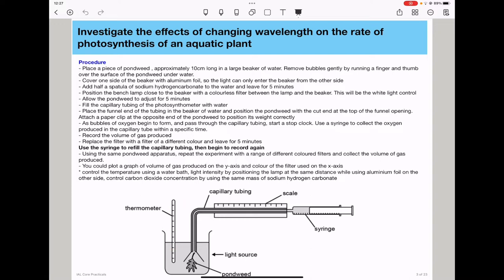We have a thermometer to monitor the temperature. We have a light source to provide light for photosynthesis. Photosynthesis is divided into the light-dependent and the light-independent. The light-dependent reactions require sunlight, so we'll need to provide that, so that reduced NADP as well as ATP can be produced in the light-dependent reactions, so that the Calvin cycle can be carried out.